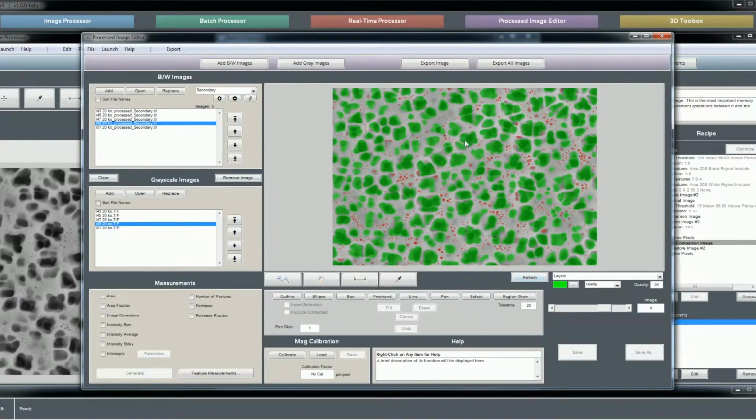Even though both are being shown, the current layer that is selected is what any interaction would operate on. So any manual edits, any measurements that are made, are happening on the selected layer, even though you're seeing both in the layers view. And here's where you would change the color of the selected layer. And if we went to tertiary, now you'd see its color shown here.